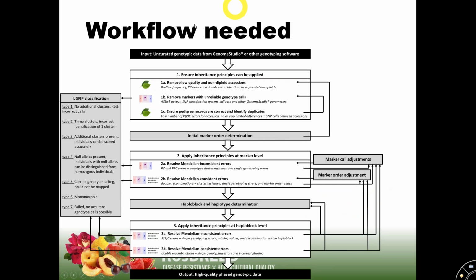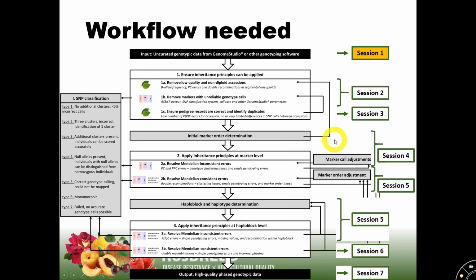And so this is the workflow I'll be talking about starting today and over the next sessions. This is a figure from a paper we submitted. There are different steps that we'll be talking about. Today I'm mostly going to talk just about GenomeStudio and getting our genotypic data. And then from the next session onward, we'll start talking about fixing issues with our data set, all the way up to the last session where I plan to talk a bit more about what we can do with the data.